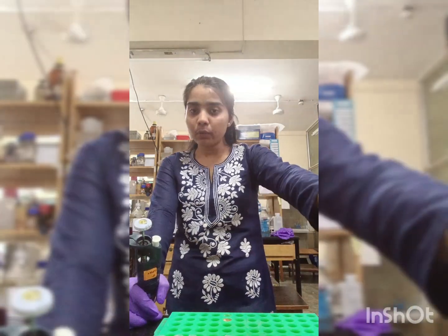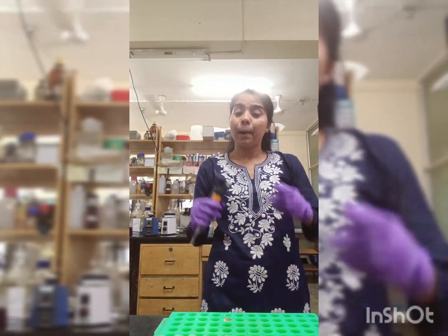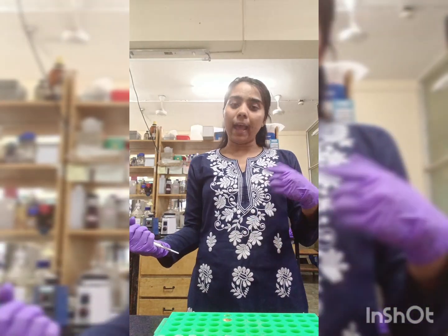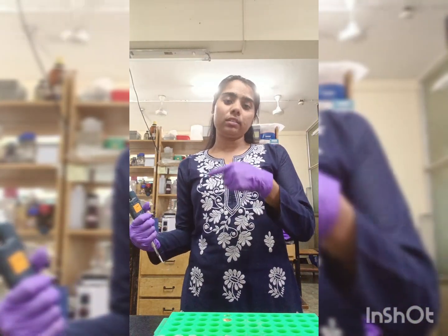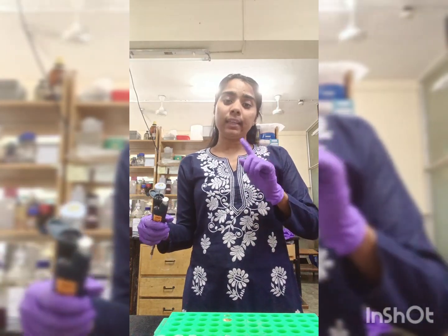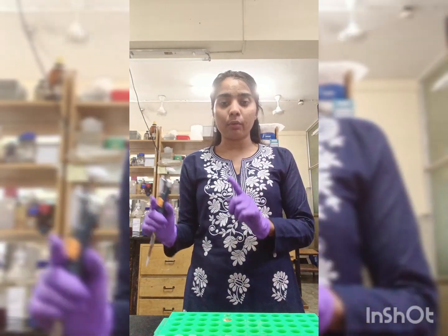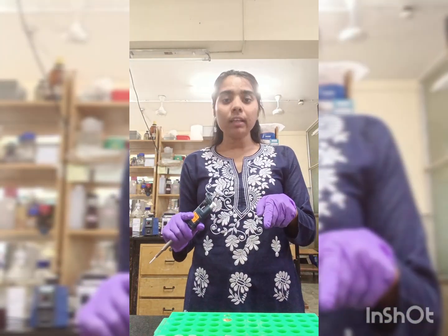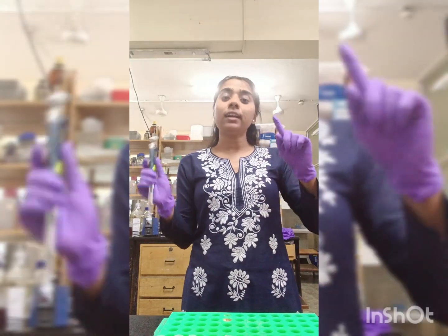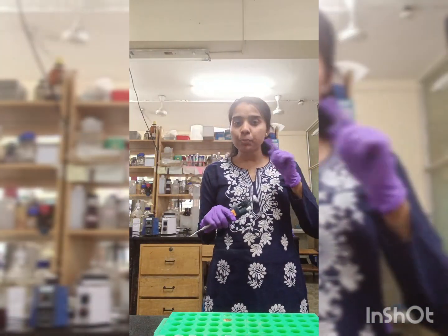That's why we dilute our protein in the Bradford and then measure, because it can detect only up to 1 mg per ml of protein. So I first add 18 microliter and then 2 microliter, so it's like a 10-fold dilution. After measuring the absorbance and calculating everything, I'll multiply that concentration by 10 to get the correct concentration of my protein. Now I'll add 2 microliter of each protein in the test vial.